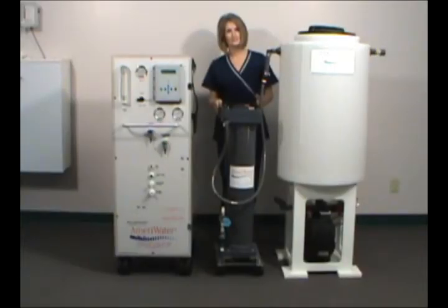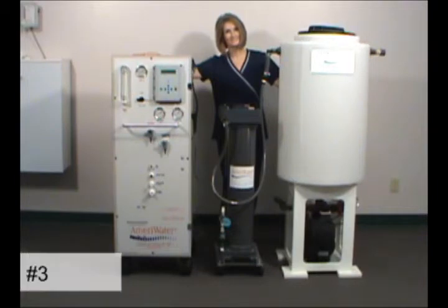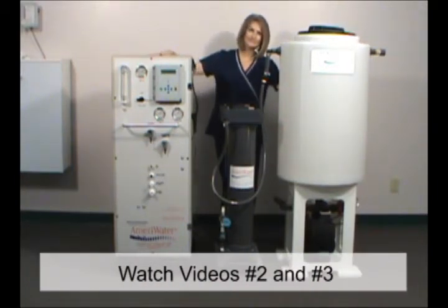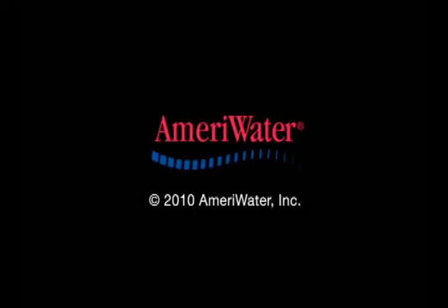As you've seen, AmeriWater's high purity water system is compact and simple to operate. To learn more about the installation and start-up of the system, watch the second and third parts of this video series from AmeriWater.